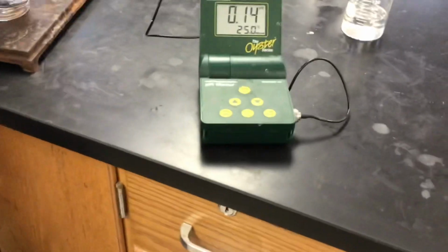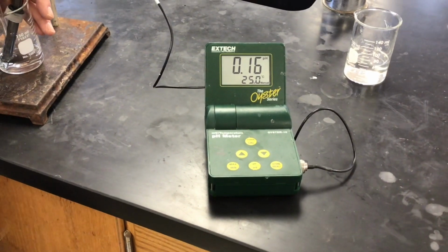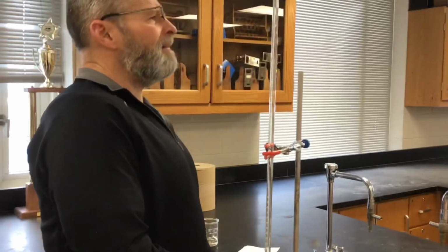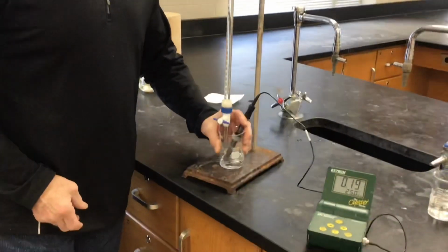Every time we give it a swirl, the pH shouldn't start changing by a whole lot, as you see. Stabilize? Yep, that's good. Okay, there's 3 ml.